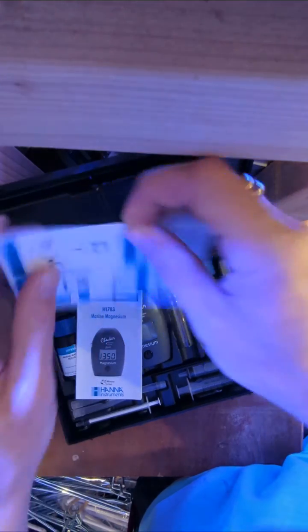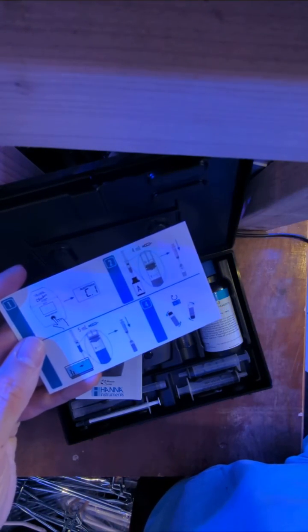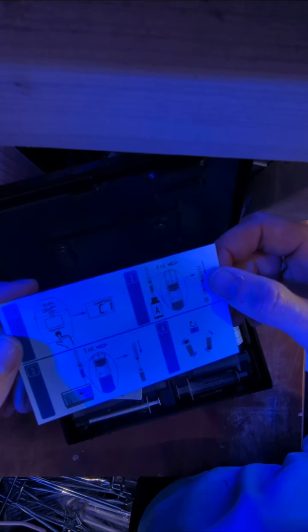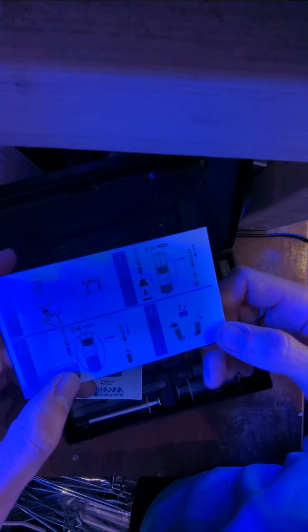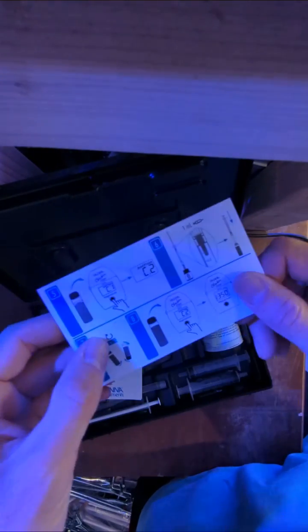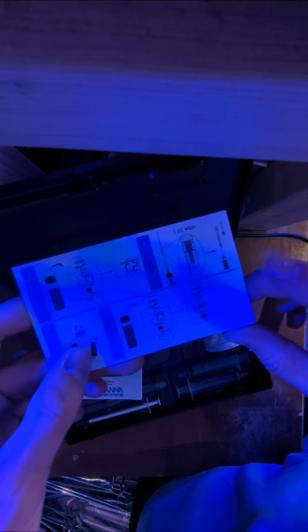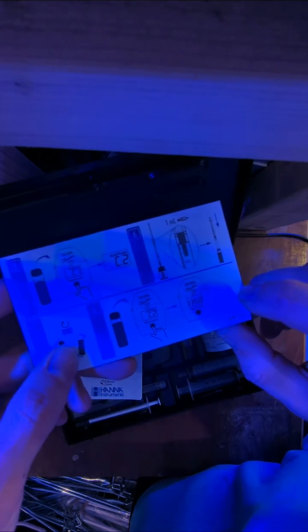Let's have a look at the instructions. So here we go - it looks like you put 4ml of A in, 5ml of water, shake or flip over 5 times. And then you do 1ml of B, flip over 5 times and on. So it should be nice, quick and easy.